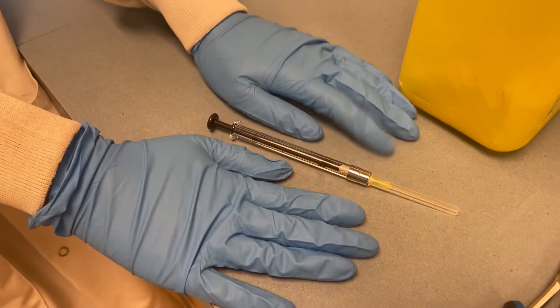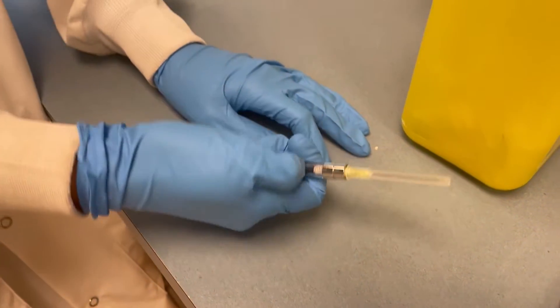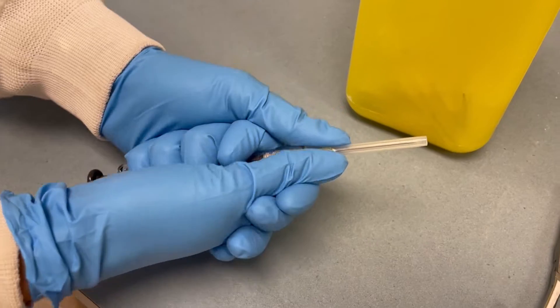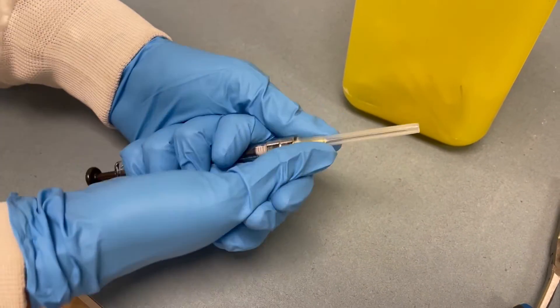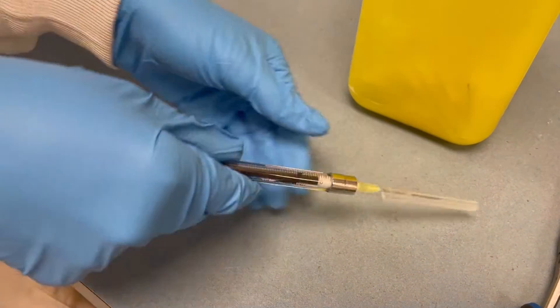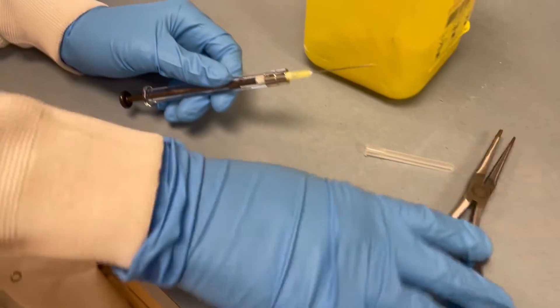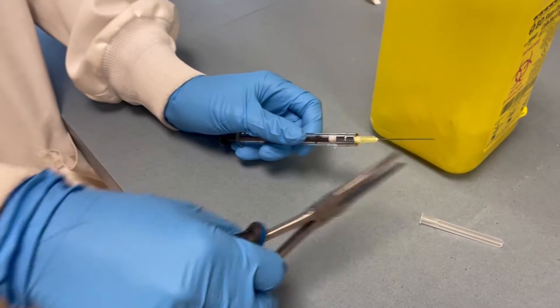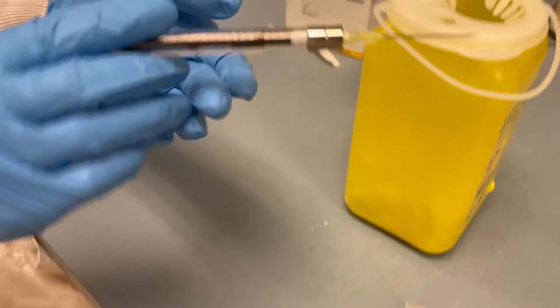When you have the luerlock needle on a syringe and you want to remove the cap, hold it firmly in one hand or both and remove the cap with both thumbs. If you're having difficulty doing that you can also use a tool to help you remove the lid.